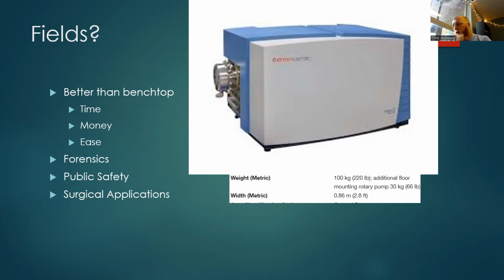We can think about this in public safety, right? So at the airport, right? If we're able to detect if there's trace elements of explosives in the air at the airport, as a military application, right? So if we're able to put this on a Humvee or on a soldier in a backpack that's able to monitor the air around them for chemical warfare agents.